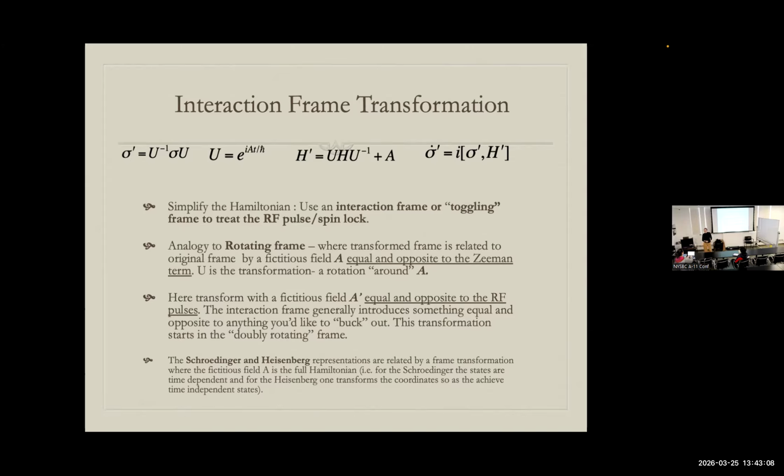Toggling refers to the idea that sometimes it's more than one pulse. Then you have one for each spin, and each of those in a more complicated sequence could be in blocks. So it might have discontinuities and so on, but we have to follow everything the RF is doing. I call that a toggling frame.